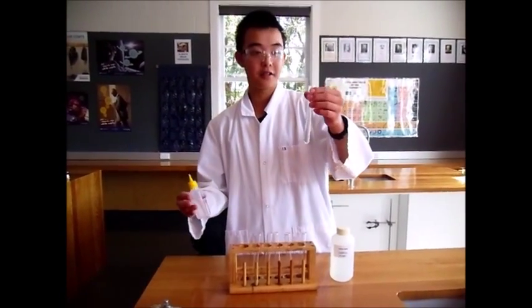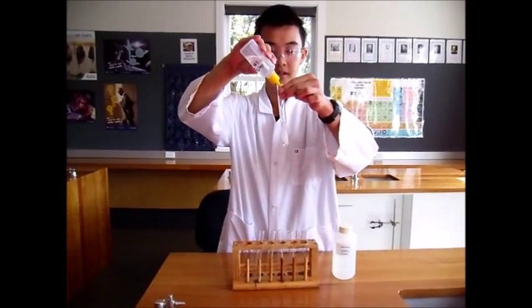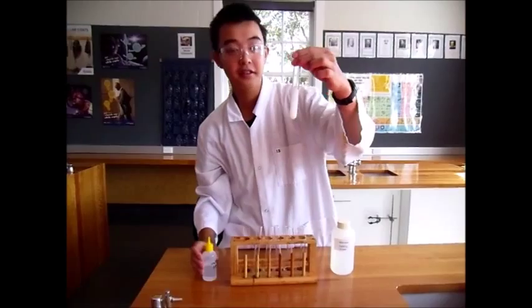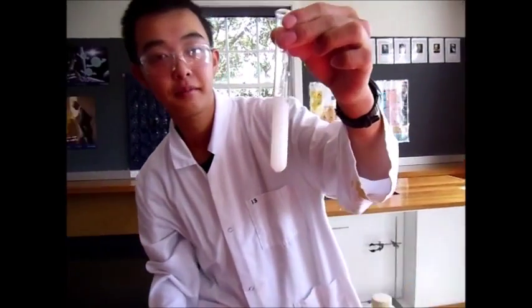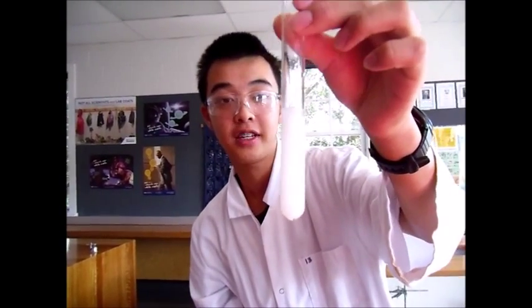So inside here I have some calcium nitrate and I will pour some sodium carbonate. This is a precipitation reaction because an insoluble gelatinous white precipitate has formed at the bottom of the test tube.